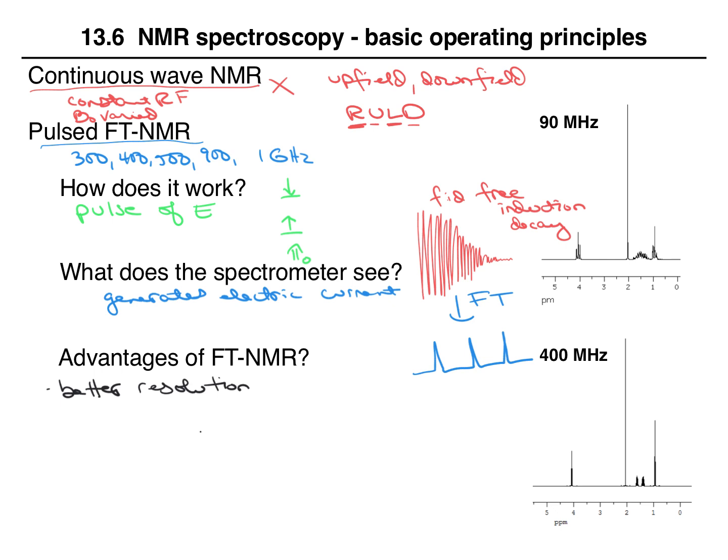So let's say at a low magnetic field strength, we're going to get a signal like this and then another signal like this, so that overall what we see is just kind of this lump. But at higher magnetic field, we get the signal centered at the same place, but we're going to see separation between them, so more detail.